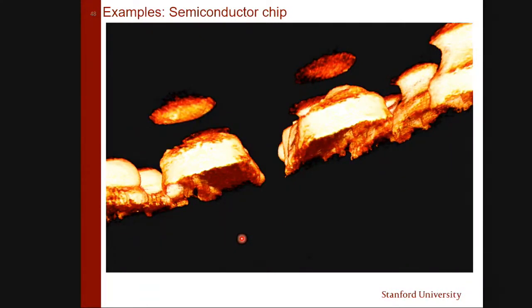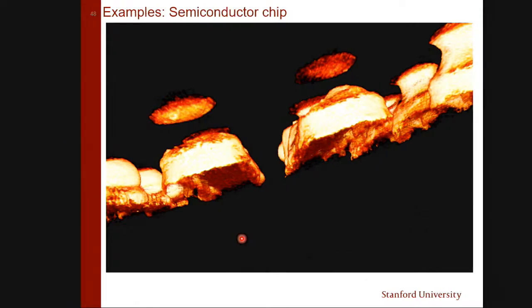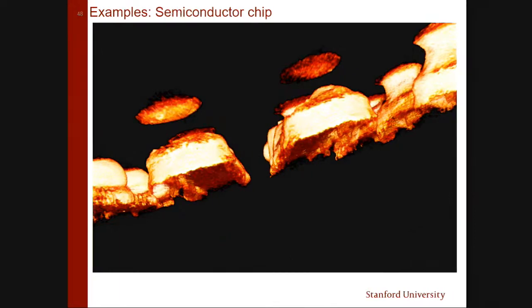Another cool example, and it was published in a Science paper just this month, and that's why I'm not showing teeth, I'm showing another example. It was a very cool experiment we did. I helped them a lot, so they acknowledged me, didn't put me as co-author on the paper, but acknowledged, that's very nice. So they studied bacteria. Usually you think about bacteria, they're very, very small. This bacteria is big. It's like 5 centimeters.